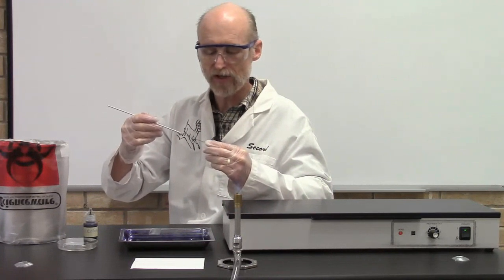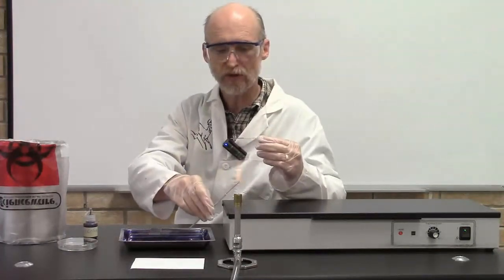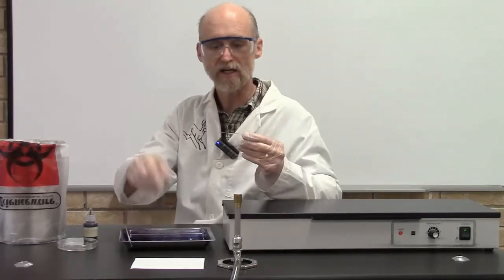And stay away from your finger. You don't want to get the bacteria all over you. Now immediately flame and cool your loop to destroy the excess bacteria. And now you're ready to spread out the dye.